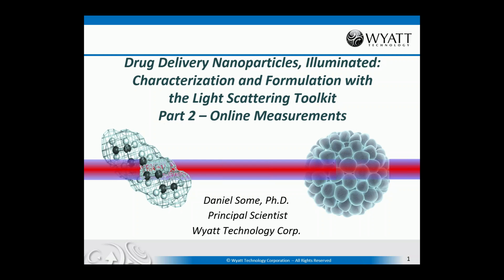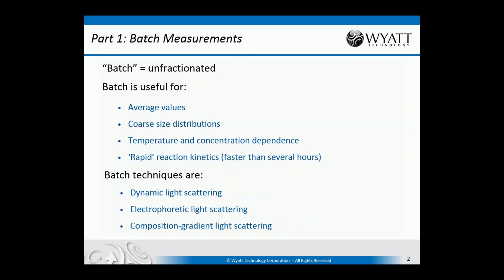Well, thank you very much, Lindsay, for that introduction. Welcome all to the webinar. For those of you who are interested in viewing part one of this webinar series, which dealt with the characterization of drug delivery nanoparticles by unfractionated measurements, it is available on demand at the Wyatt website under Library Webinars. So please feel free to take a look at that. And without further ado, I will proceed to the next part, which is how we can characterize drug delivery nanoparticles with online fractionated measurements.